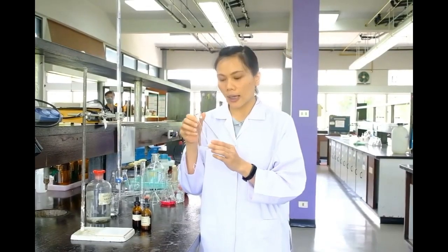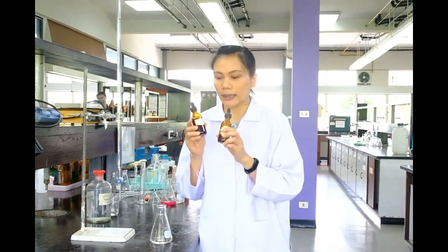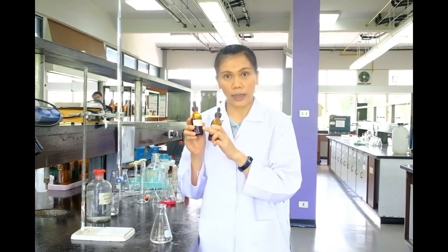The second part is titration by measuring pH. First, before titrating by measuring pH, determine a rough endpoint by pipetting 20 milliliters of maleic acid solution into an Erlenmeyer flask. Then, add 2 types of indicators. The first indicator is methyl red, and the second is phenolphthalein, 2 to 3 drops. Since maleic acid is a diprotic acid with 2 protons, we will have 2 endpoints.